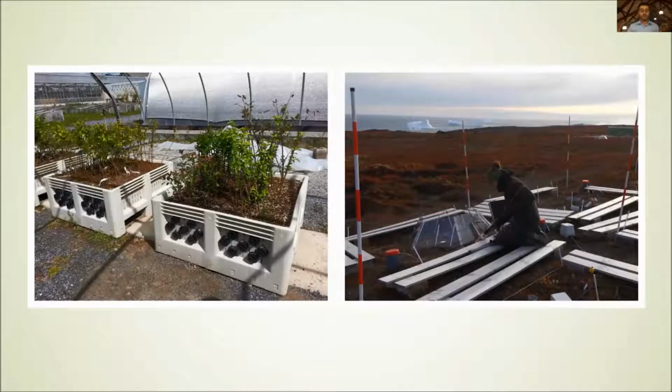To give a good example, here we see tubes in a horizontal method. They have installed them right throughout the bed of these different boxes. You can take the scanner out, place it in one tube, do your scans, pull it out, place the cap back in, and just keep doing that repeatedly, fairly rapidly, being able to get a full record of the root systems of all the plants in that box.